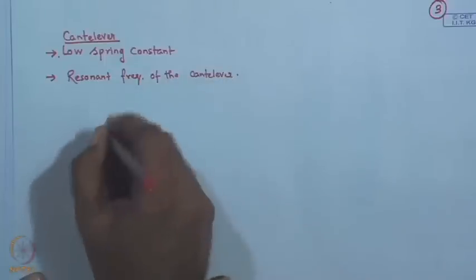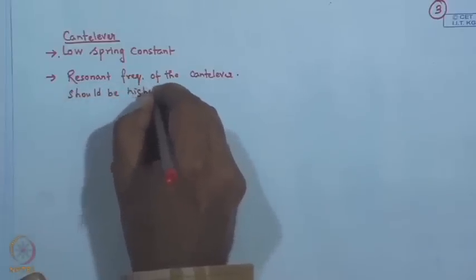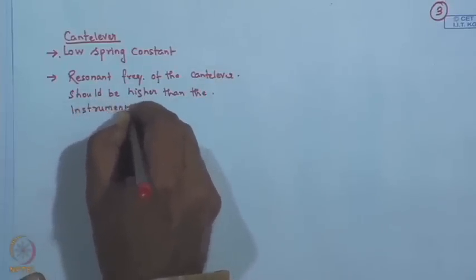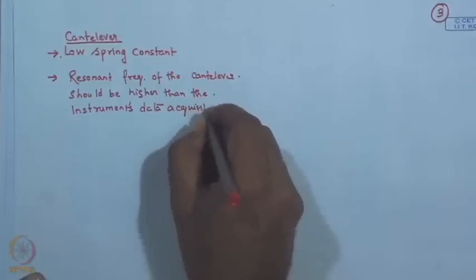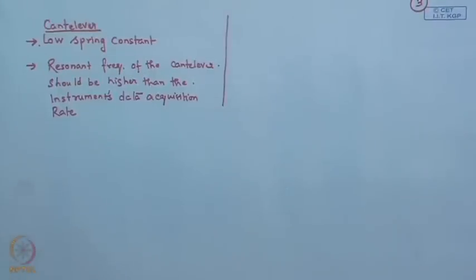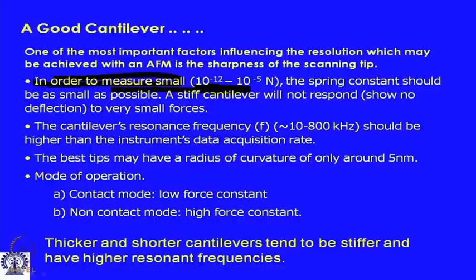should be higher than the instrument's data acquisition rate. This is extremely important, that you must have a resonant frequency which must be higher than the data acquisition rate of the instrument. Otherwise, there will be a mix-up and you won't get the appropriate data.